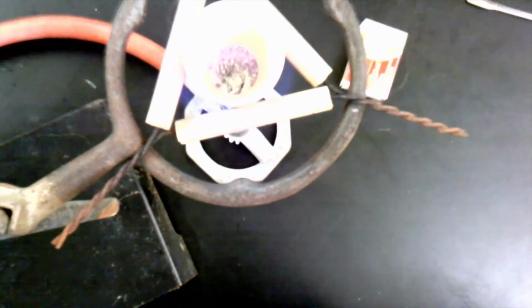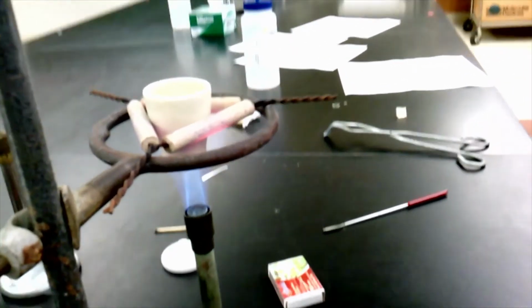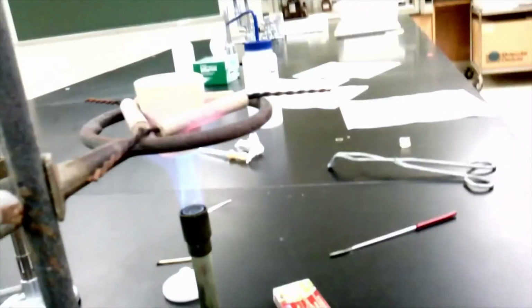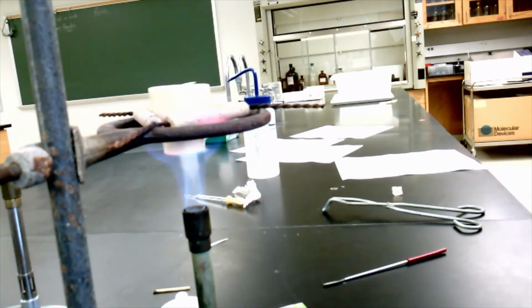It's kind of glowing red at the bottom, but the metal itself is no longer burning, it's no longer flaming. So we're going to heat this strongly for about 5 minutes. Okay, I'm just going to leave it like this. Nice strong flame from my Bunsen burner. I'm going to heat it like this for 5 minutes, and then I'm going to add some water to it.